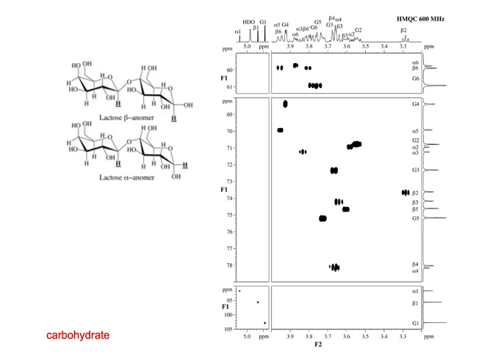Okay, here's the HMQC, right? And so this would help us, I think, in our assignments of the COSY even, because we can see the CH2 group there. I think this is another CH2 group here. There's only 2 CH2 groups in the molecule on these 6 positions.